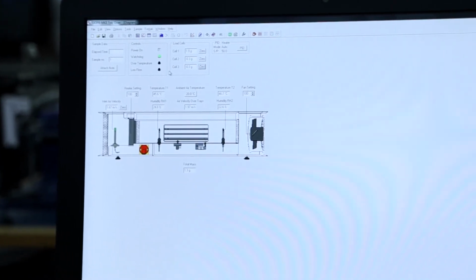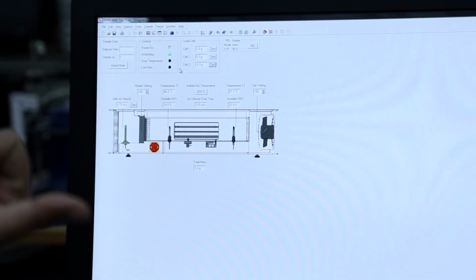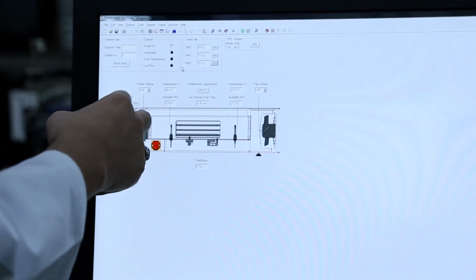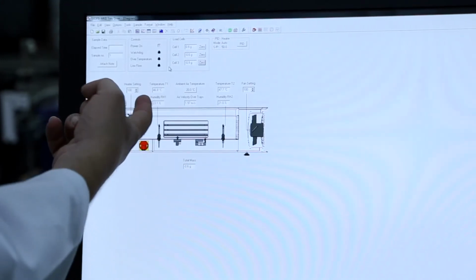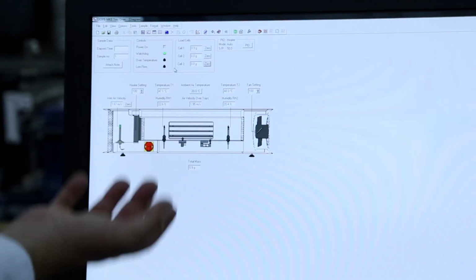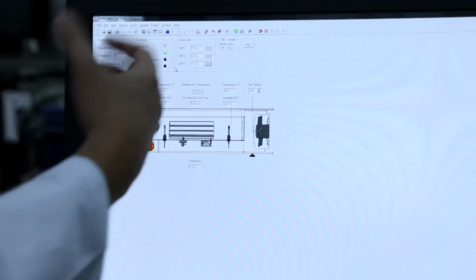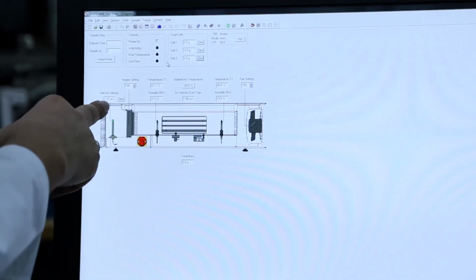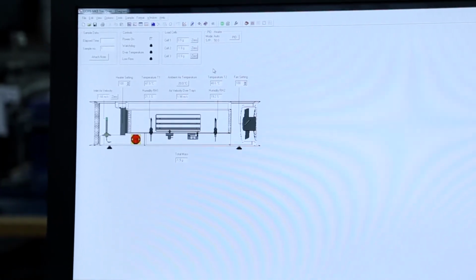Okay, so now we set the temperature. Now the initial temperature is 45. If you remember, we set the heater as 90, is 50, sorry, but the air makes some cooling for the heater, so it's starting, or the pre temperature of the air is 47, but after some time it reaches 50. And here we have the velocity. You can increase or decrease according to the fan speed.